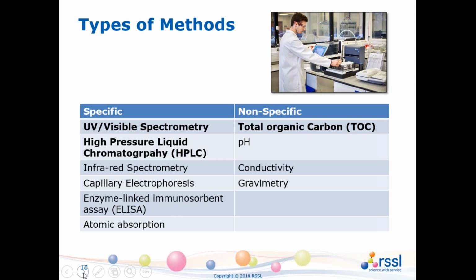Obviously sensitivity can often be an issue. Sometimes you can use LCMS, but predominantly LCUV would be the chosen technique. Although we have an example, from a factory tour I did a few months ago, where part of the process was actually using a brass bristled brush to clean sieves. What we decided in that case was to employ atomic absorption, to see if we could capture whether any metallic material had been lost. So in that case, atomic absorption is a very good technique.